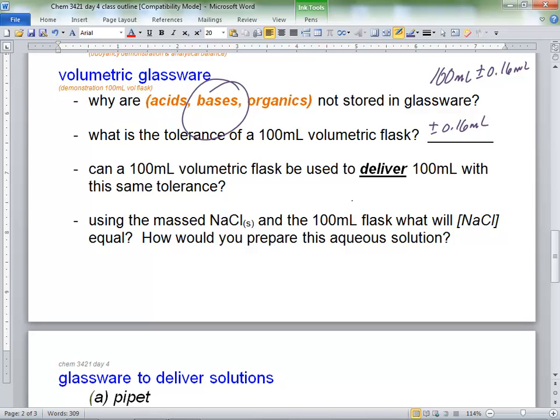You have to physically do this 12 times if it's all dissolved. If it's not all dissolved, then once it all dissolves, it's 12 times. Does the concentration matter, like with a supersaturated solution? I'm just talking about a typical homogeneous solution, no tricks. To get a solution well mixed after you prepare it, 12 inversions.